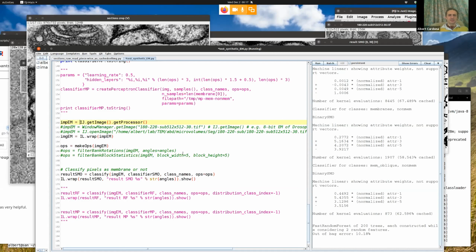And then for this image plus, I'm going to create a new one, image plus with title. This would be basically a subset or ROI or something. ROI of large data set. I just want to get that processor.